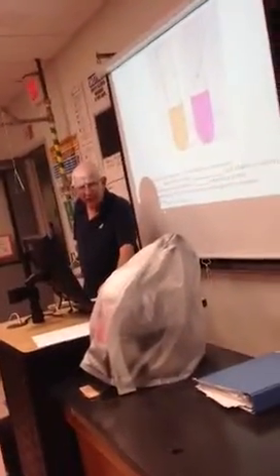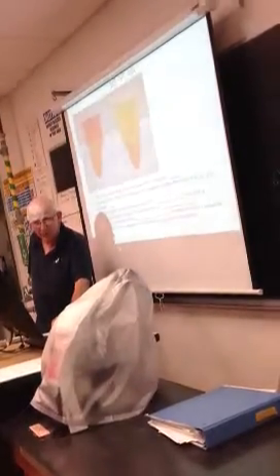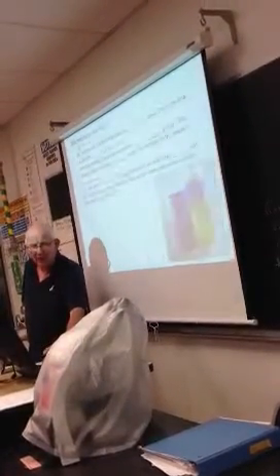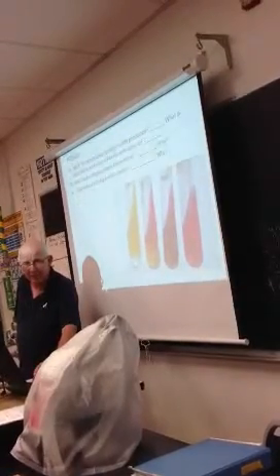Okay, this one we're going to do next time. This one we'll do next time. This one we'll do. I hate this test, the nitrate test. I dread it. Okay, MRVP. SIM we'll do next time. Decarboxylase we'll do next time. TSI we'll do next time.